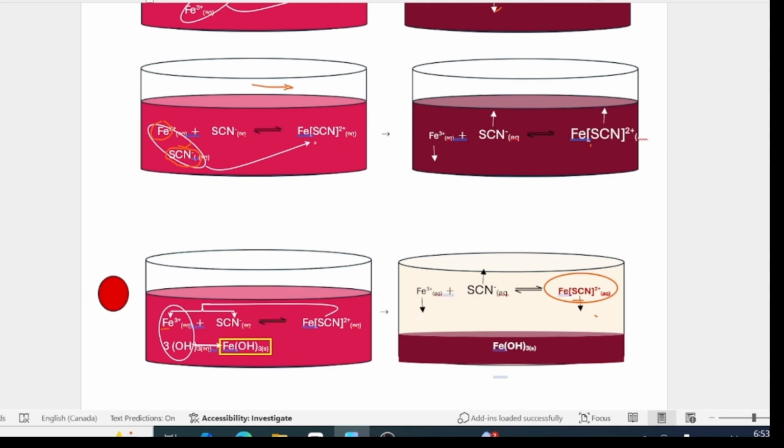And because a higher concentration of that was produced, it caused the color of the solution, like the one before, to turn darker as depicted in this diagram here. Two other points. Because some iron ions were used up to react with thiocyanate ions, the concentration of iron went down, but the final concentration of the thiocyanate ion remained a little bit higher.